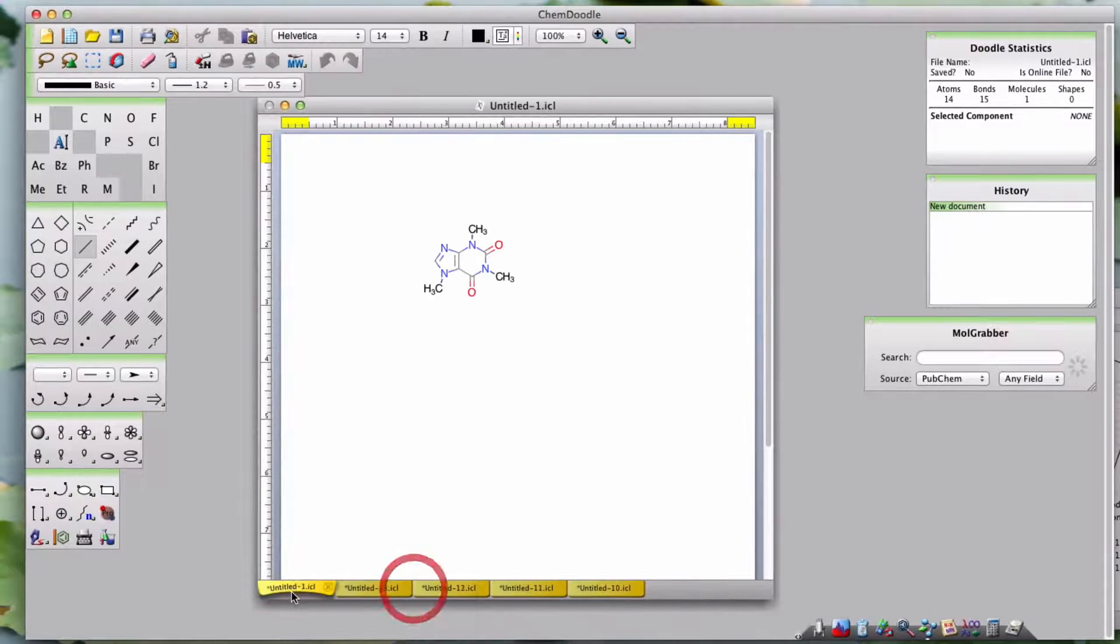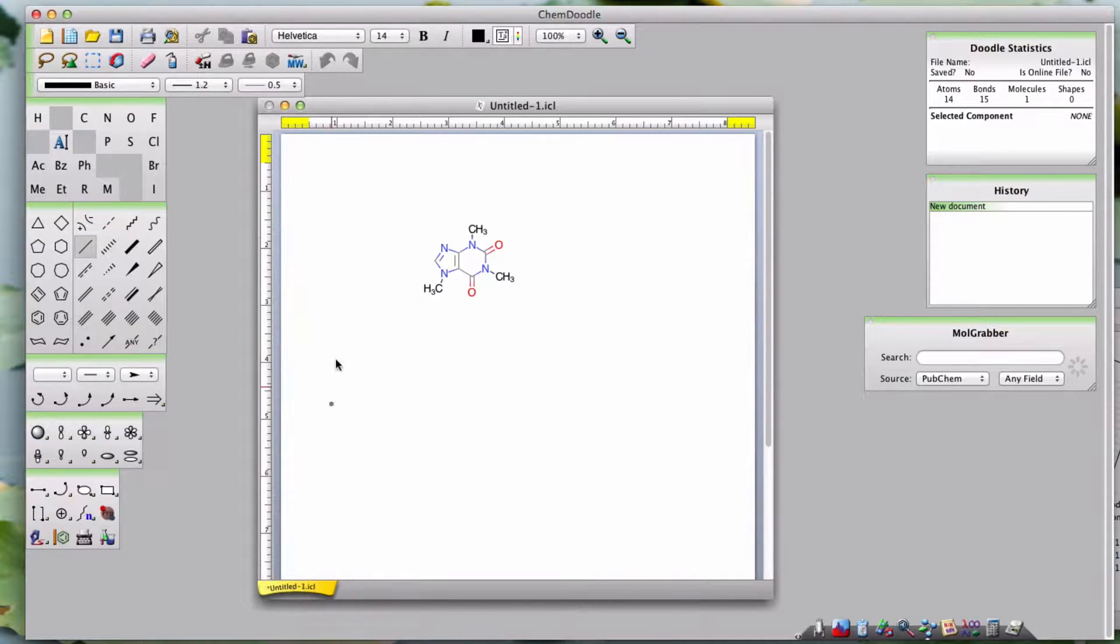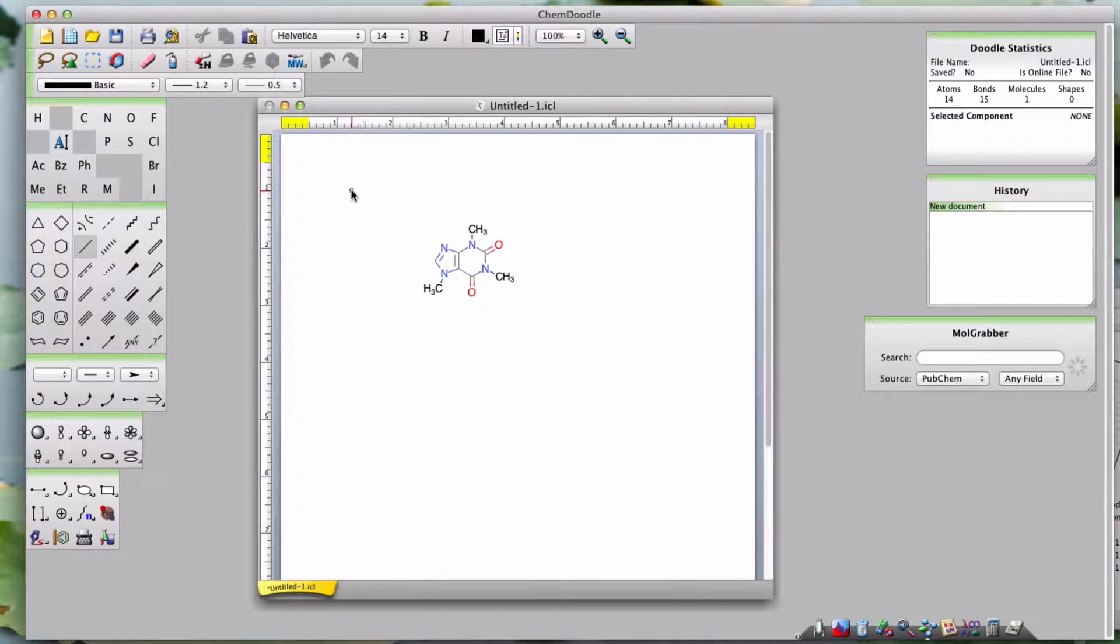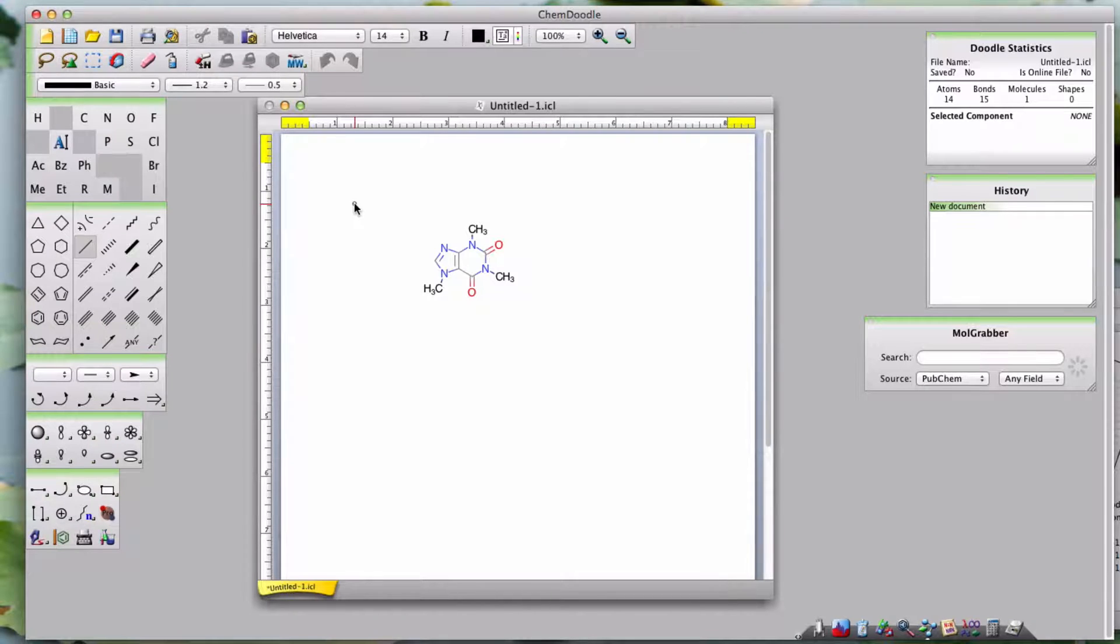You might have noticed that there are more cursor symbols than just a basic pointer. Each one is contextual, dependent on what tool you have selected and what your cursor is hovering over on the doodle area. Let's go through them and see what each one means.